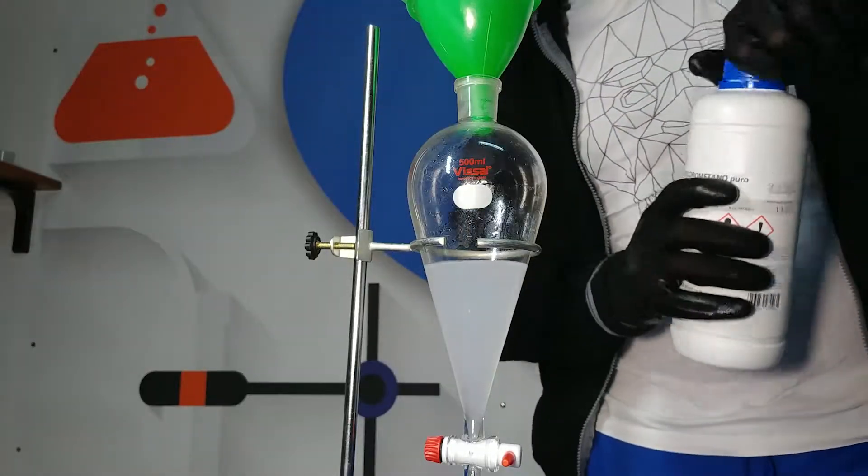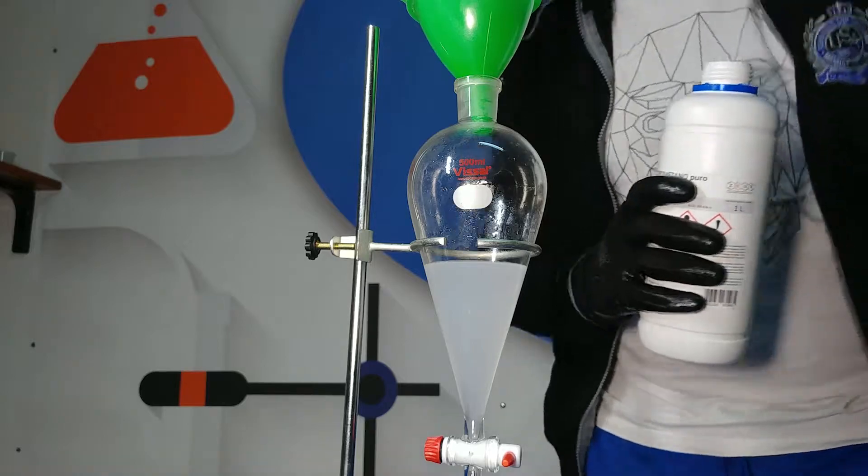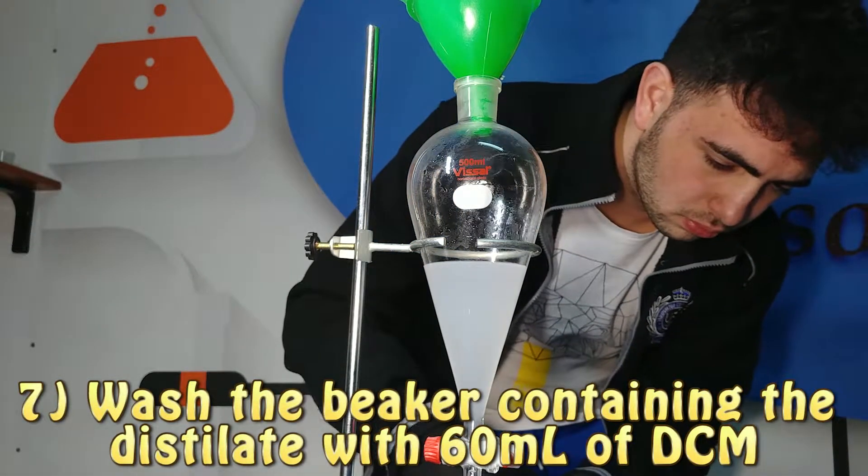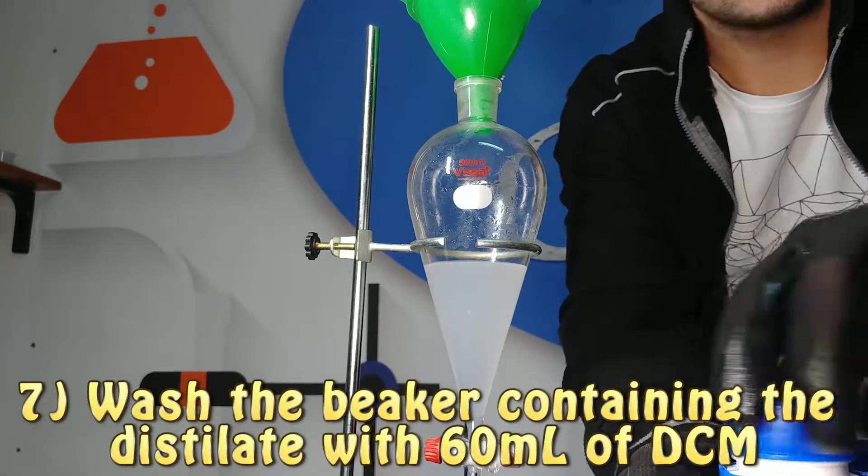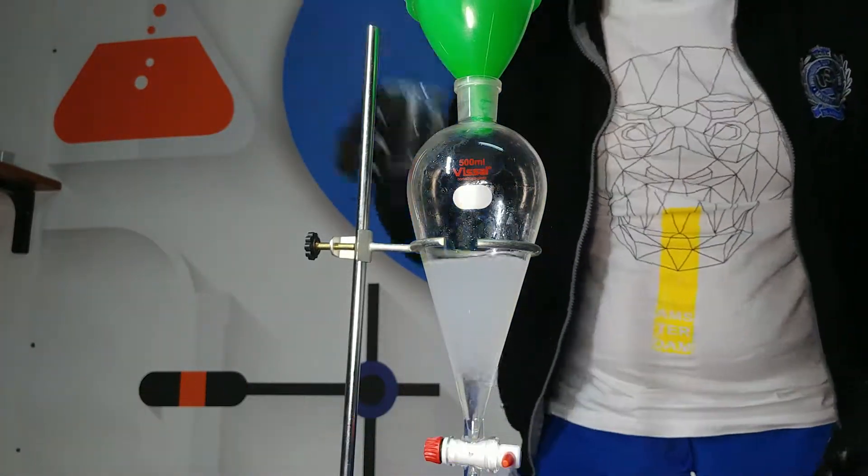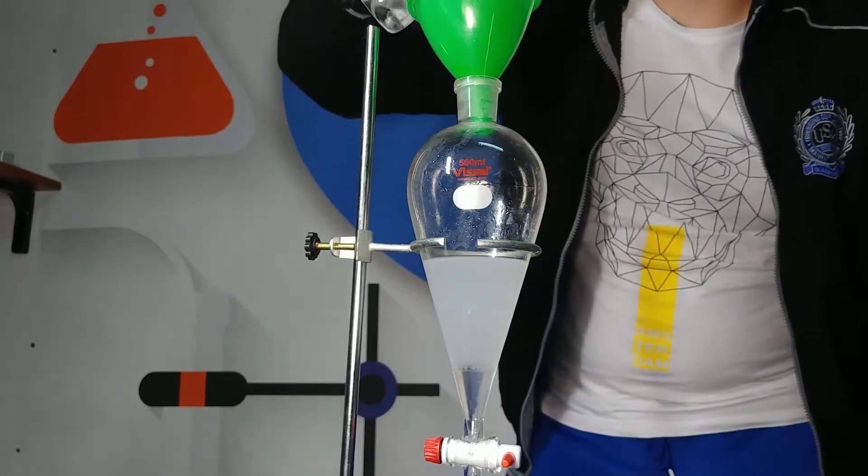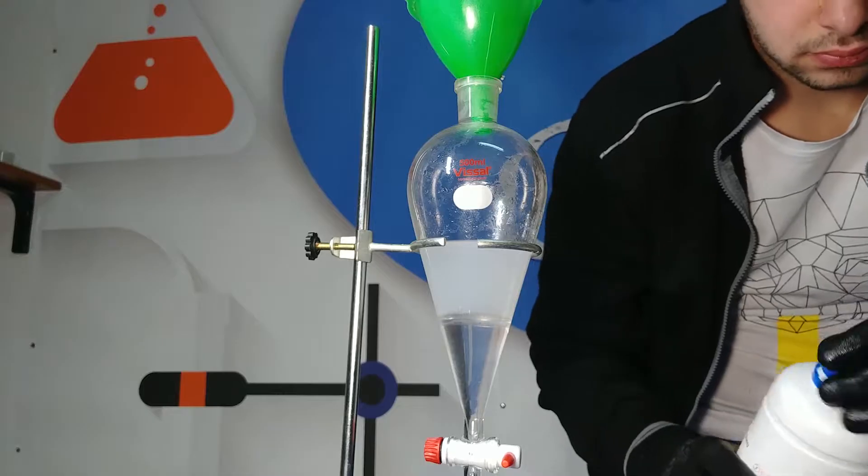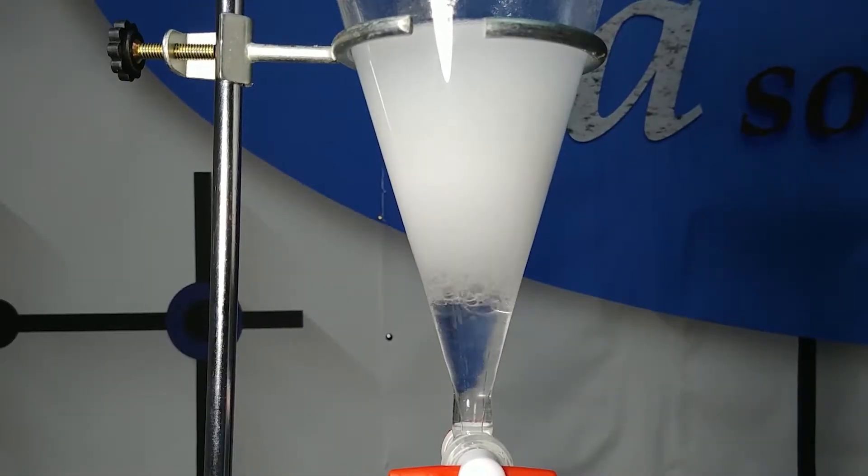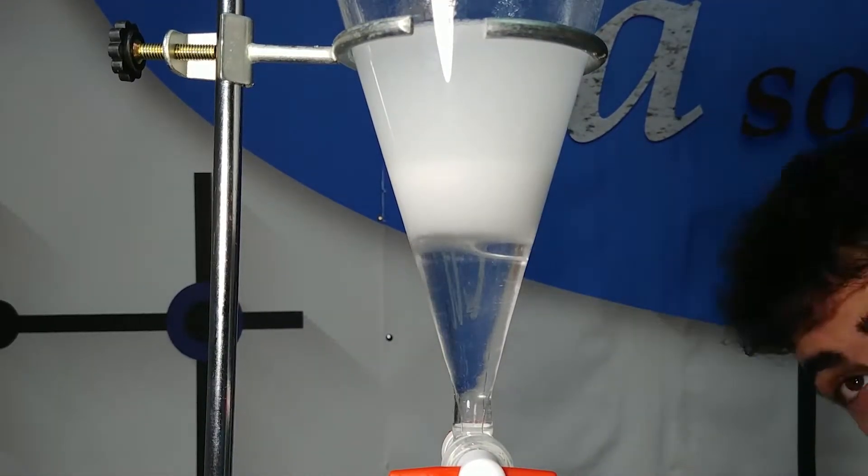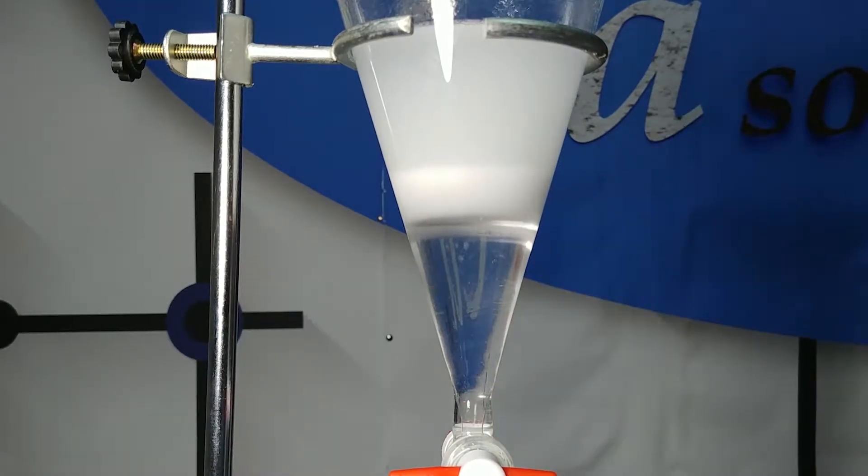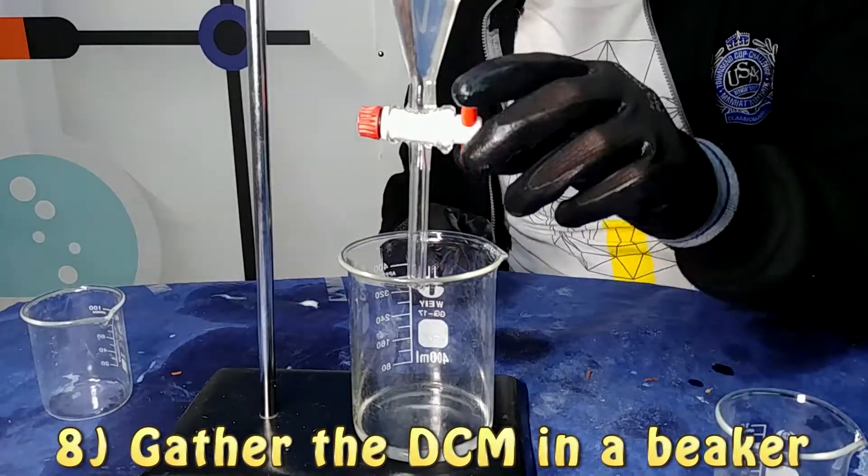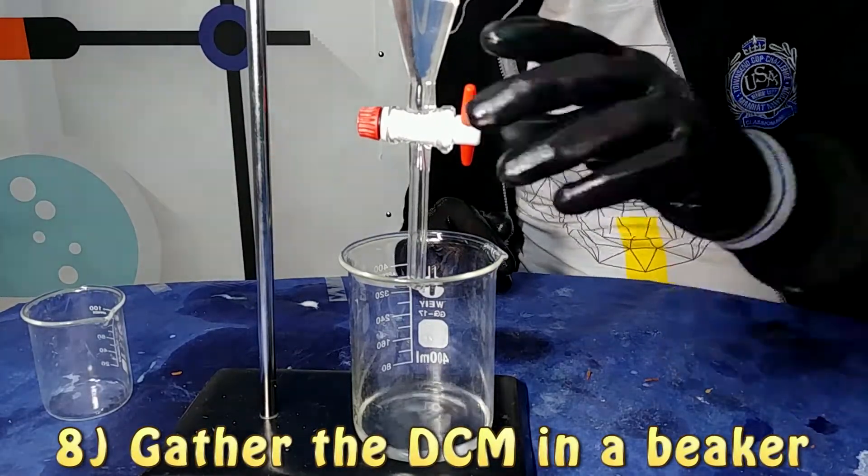We are going to put our solution into a separatory funnel. We are going to add 60 ml of dichloromethane and wash it with that and pour this dichloromethane into our separatory funnel. Then we are going to mix these solutions a bit and we are going to put away our dichloromethane.